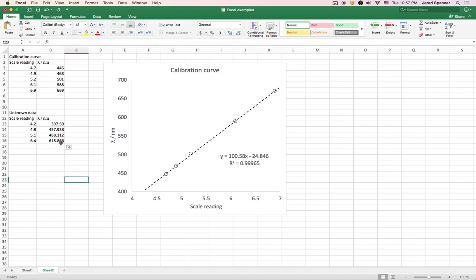Okay. Now, last thing is I've got too many significant figures here, too many digits. So what I'm actually going to do is just make this smaller. These buttons up here don't change the number. It doesn't actually round it. It just tells Excel to hide the extra digits. So I'm just going to do this to remove the decimal places.